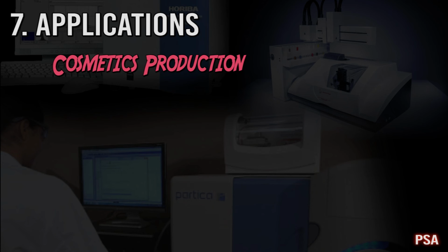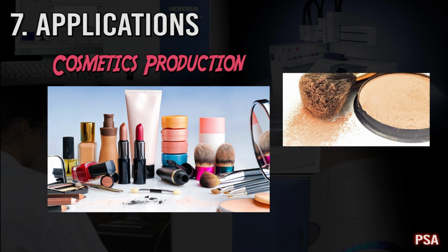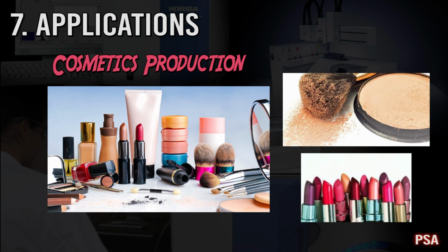Cosmetic production. The test for the quality of cosmetic products, which includes moisturizer, facial powders, and lipsticks, is reliant on the determination of the amount of particles. Thus, the manufacturers use the particle size analyzer for the maintenance and quality control of these products. The difference in the color and shine, together with the smoothness and blocking properties of the product, such as creams, are controlled by and dependent on the right particle size distribution.